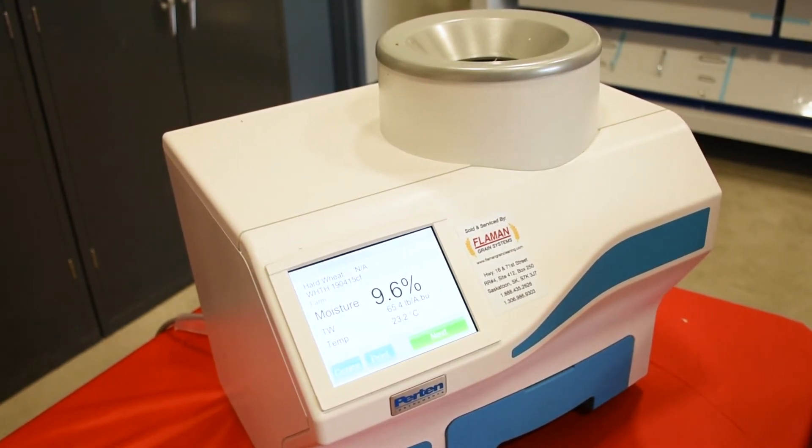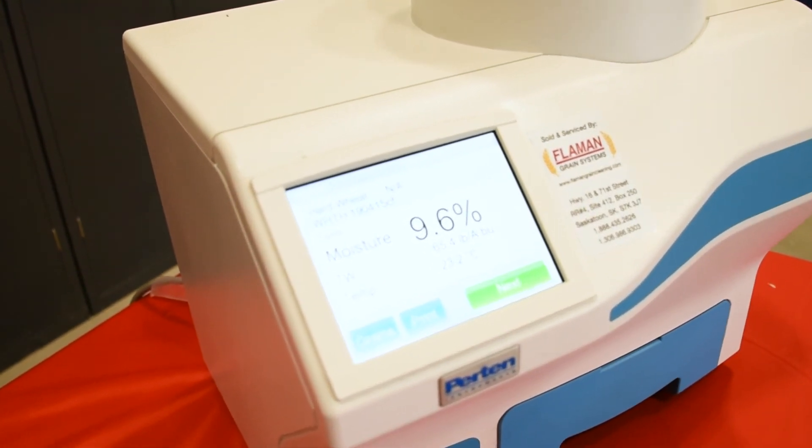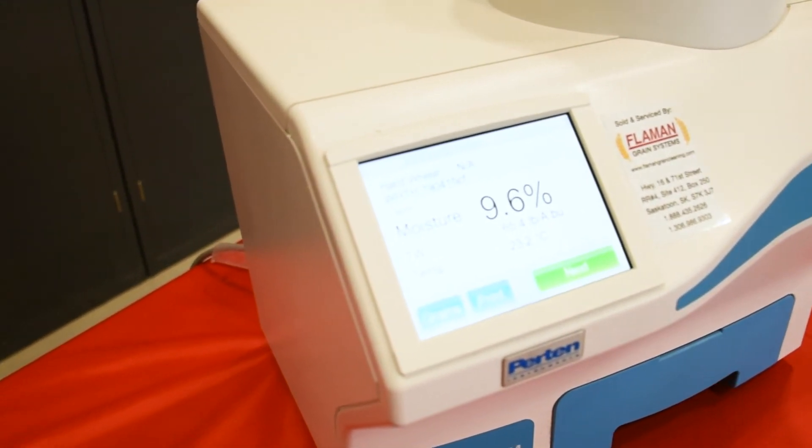If you want to do another sample, you hit next. It saves the grain you were testing and you just pour the sample in the top and hit go.